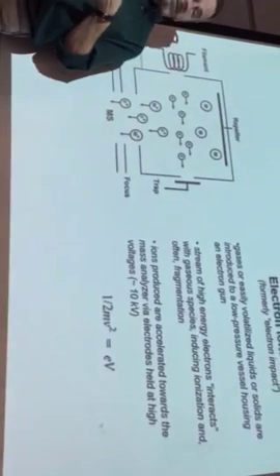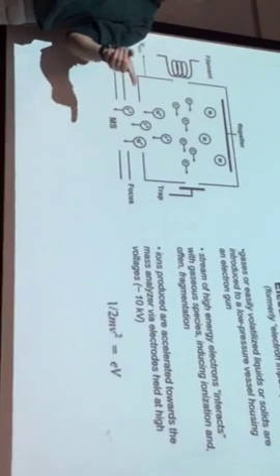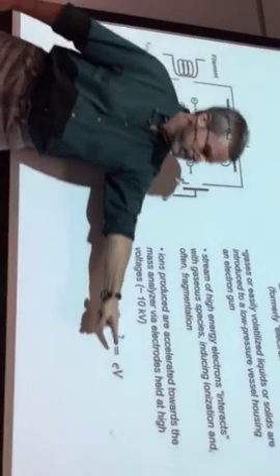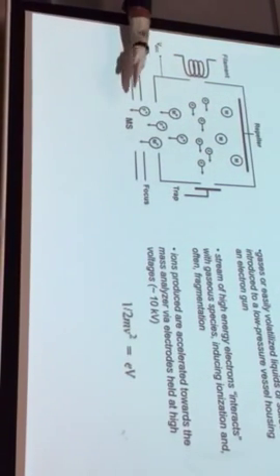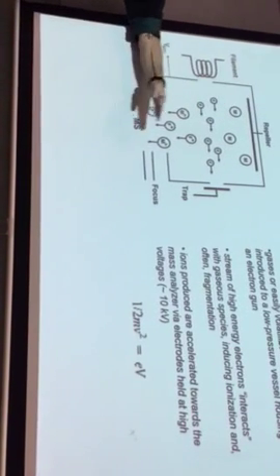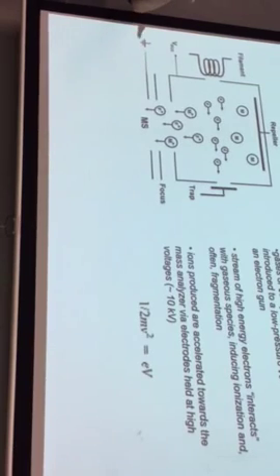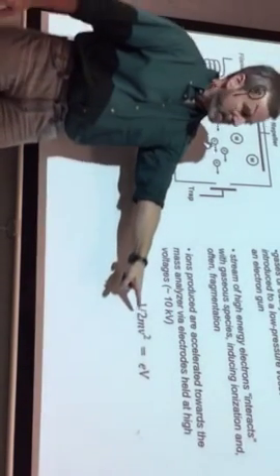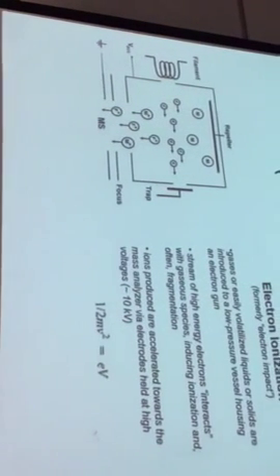They exit with a kinetic energy that's determined by the accelerating voltage, right? eV, where e is electronic charge and V is the voltage applied across the repeller focusing/accelerating electrode system. That determines the kinetic energy. So all the ions that are ejected have essentially the same kinetic energy.